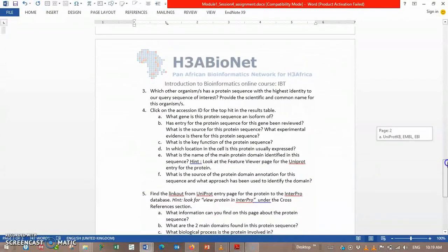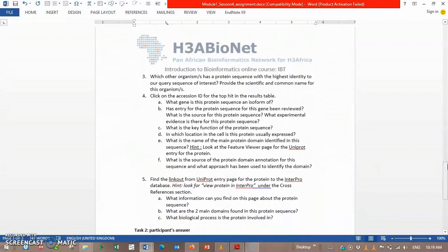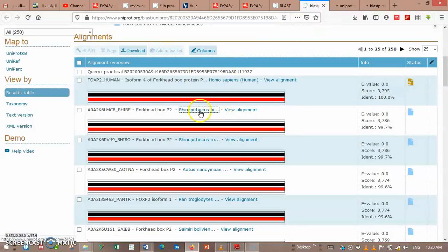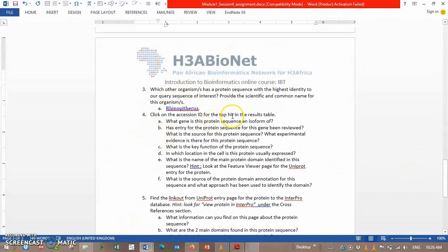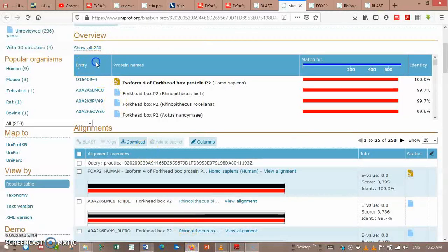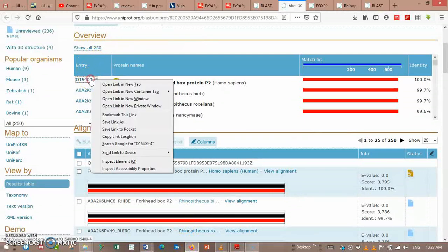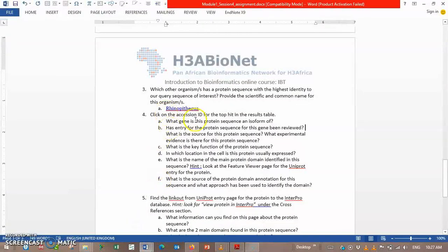Another question is: which other organism has a protein sequence with highest identity to our query sequence of interest? Provide the scientific and common name for this organism. Which other organism has a protein sequence? Then click on the accession ID for the top hit in the result table. The top hit in the result table — Isoform. So, what gene is this protein sequence and isoform of?